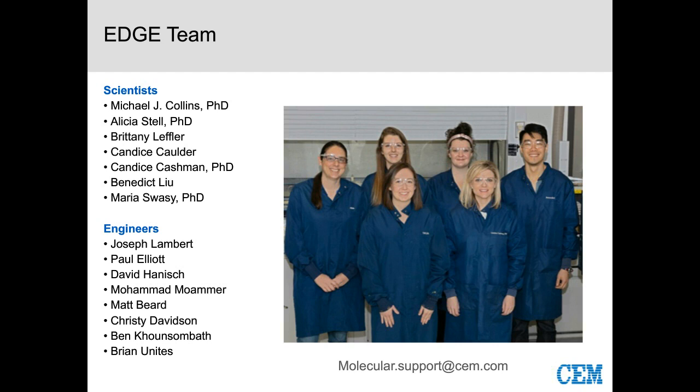So for the packaging, we would adapt our method slightly and add a longer hold time, because you need that time to really penetrate those types of samples to get a good extraction. Certainly the next step is to look at that packaging, and I said we'd probably implement closer to a 10-minute hold time for that particular method.